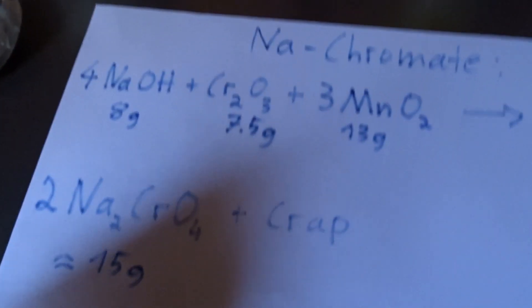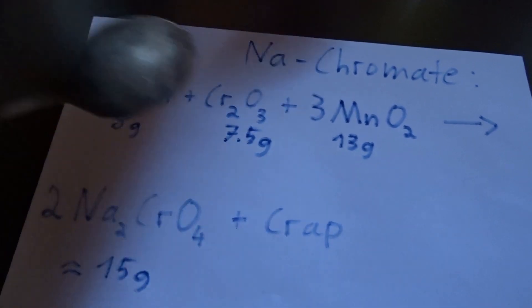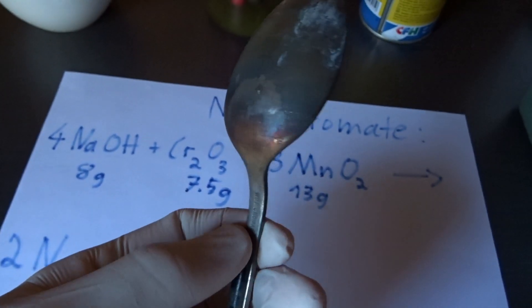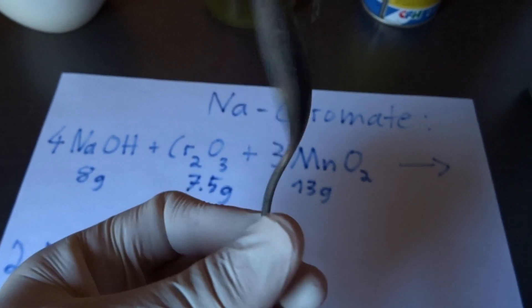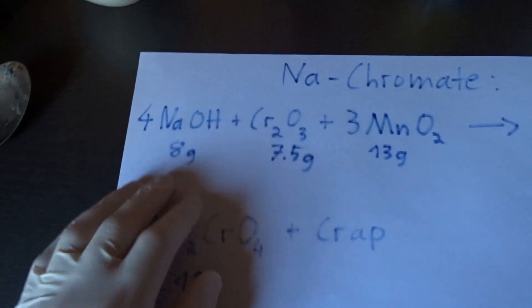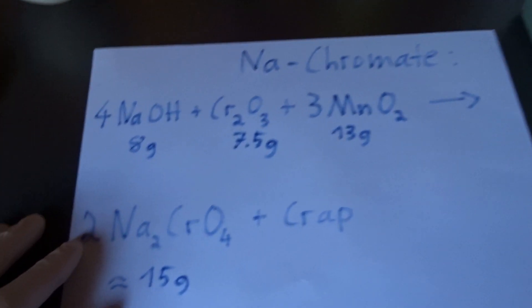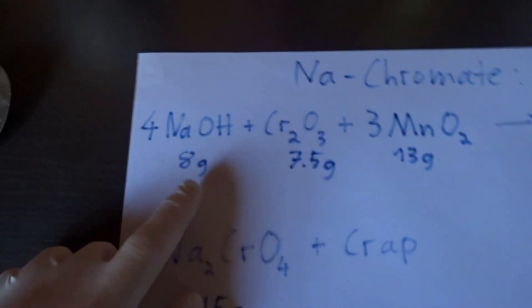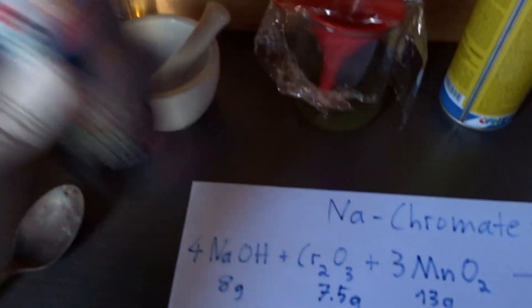Well this takes quite a while so dissolving the stainless steel and then filtering it and precipitating everything can take well over a week. While this synthesis is much faster because it uses higher temperatures.